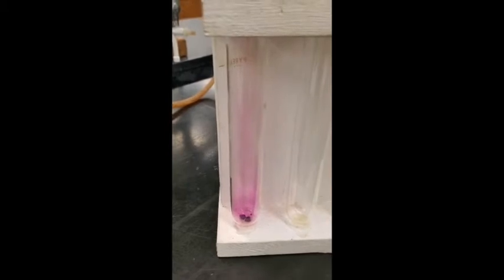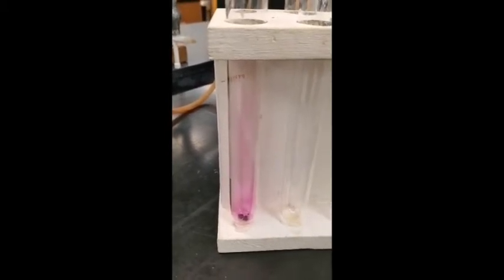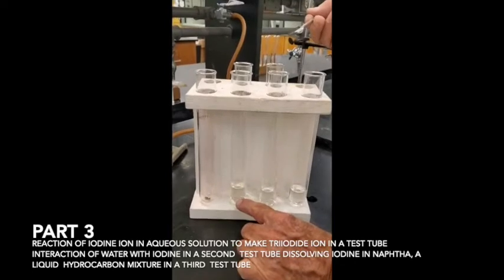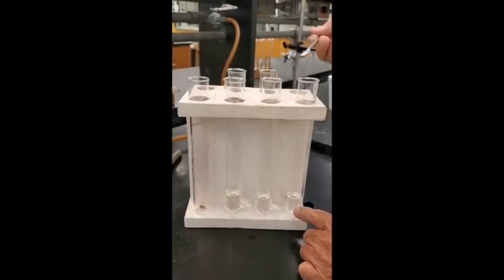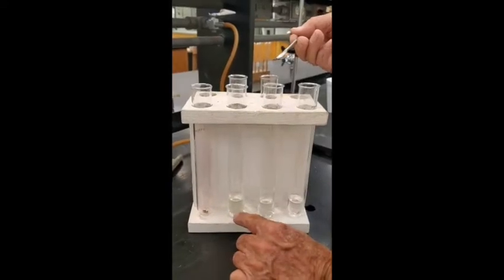If you ever see a gas that's beautiful, don't breathe it, because all the beautiful gases, the colored ones, are all poisonous. Now I have 3 test tubes. This one has potassium iodide and water. This is just water, and this is naphtha, a hydrocarbon mixture, which is used for thinning paints and stuff like that. So I'm going to add a little bit of iodine to this.